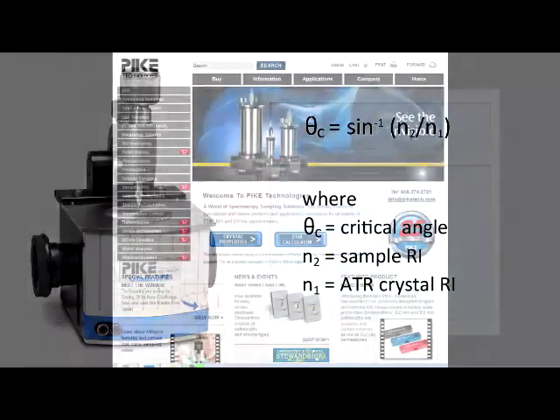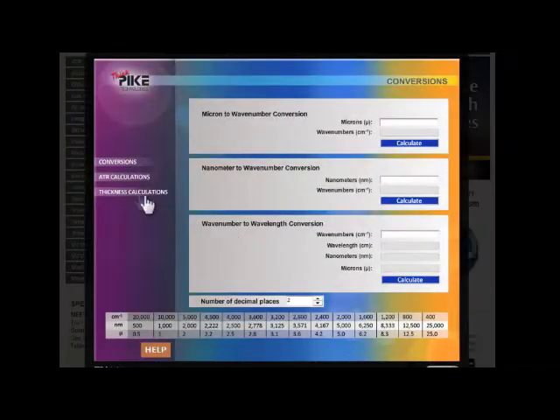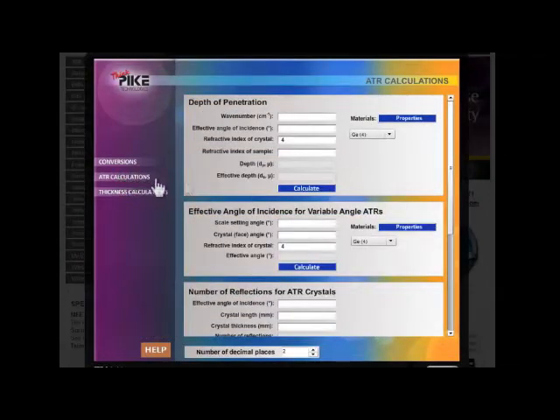To make this calculation easy, use Pike's FTIR calculator found on our website. Select the ATR tab located on the left-hand side of the program and scroll down.